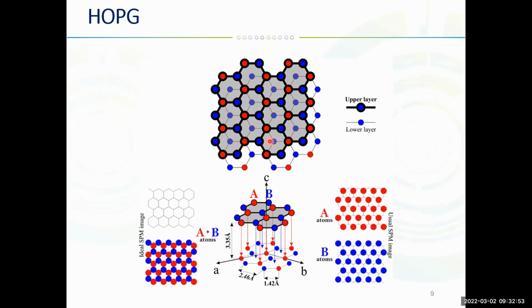In particular, like mica, HOPG belongs to lamellar materials because of its crystal structure. It's characterized by an arrangement of carbon atoms stacked in parallel layers. Carbon atoms within a single plane interact much more strongly than those from adjacent planes. This is plane 1 and this is plane 2. That explains the cleaving behavior of graphite and mica as well. In your practical sessions, you will learn how to make your substrate very flat before you put your sample on. That's called cleaving.